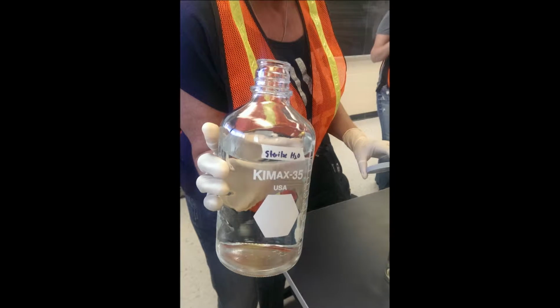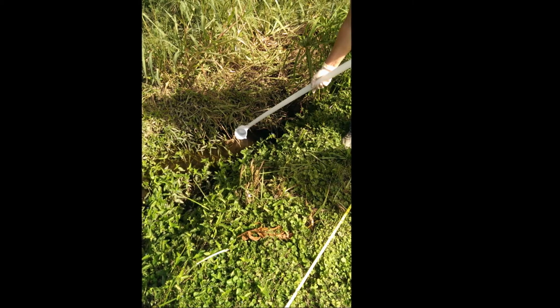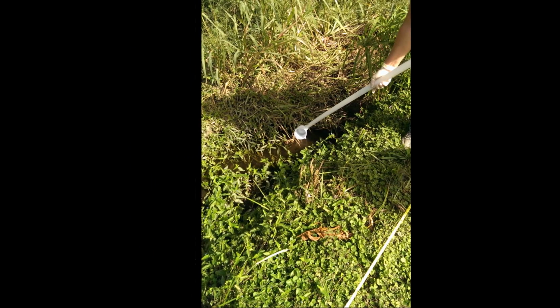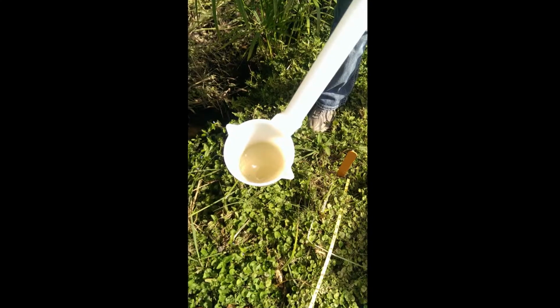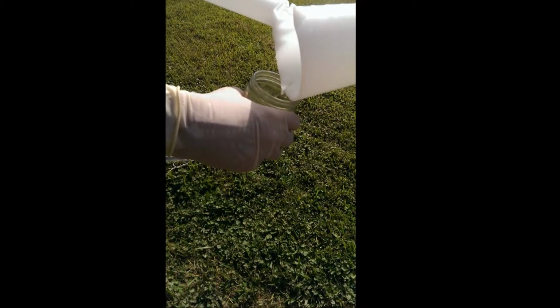Sample collection. A control sample using deionized water needs to be collected for quality assurance purposes. Using the dipper sampler, extend the device into the water and retrieve the sample. It is important to disturb the water the least amount possible to ensure an adequate sample. Next, place the sample in the appropriate labeled container.